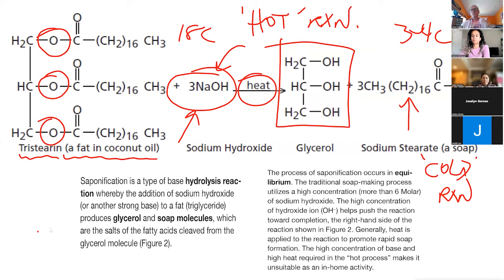So why is the reaction that we're going to be doing going to be much slower than the reaction done in a soap factory? There's 2 basic reasons. Our reaction is going to take like 3 days to complete. We'll just start it today, but it won't be finished till like Friday. Why is our reaction going to take so much longer? Is it because we're not adding heat? We're not adding heat. What typically happens to the rate of a reaction when you increase the temperature?